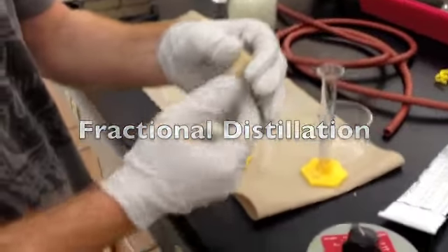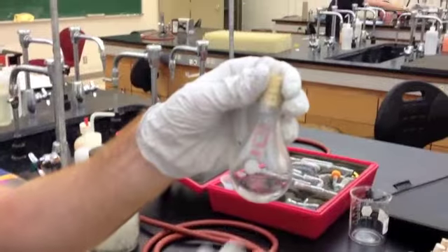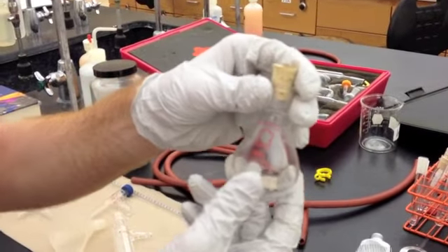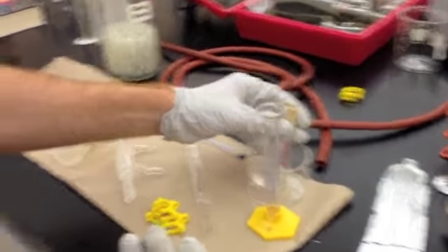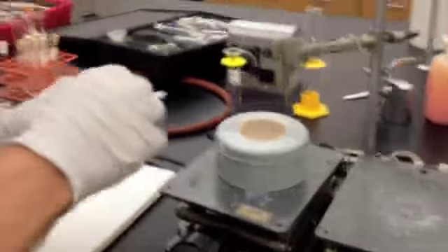Basically, you start with your solution or mixture, 30 milliliters of your mixture in a 50 milliliter round bottom flask, and you put it on the heating mantle, obviously turned off right now, and secure it with a two finger clamp.